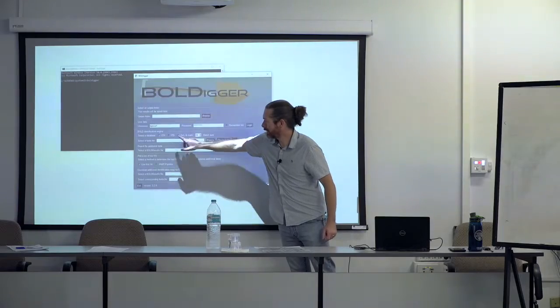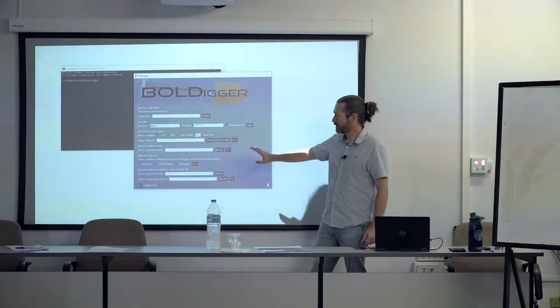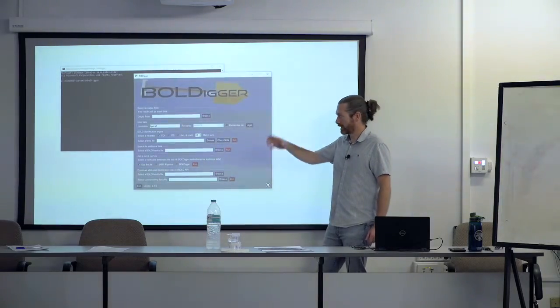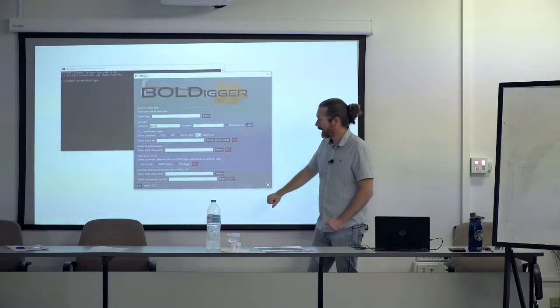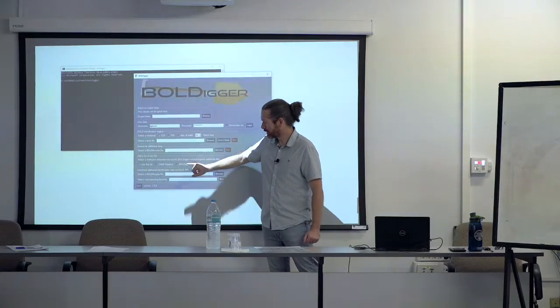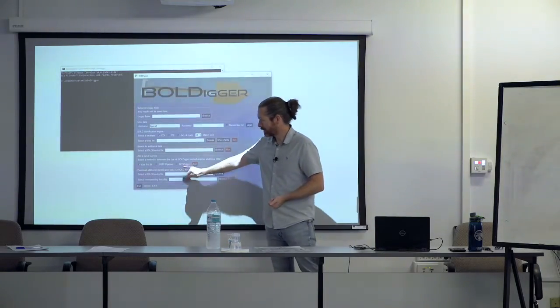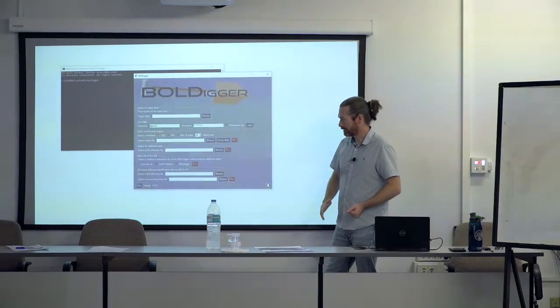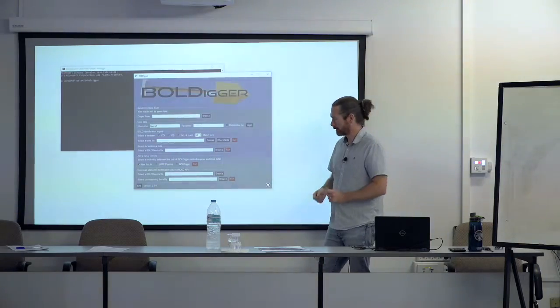It can do other markers. I've never used anything except for CO1. I think there are issues with some of the other markers, at least things like binning and, from the Bold side, the bin algorithms and things like that. So for what we're doing primarily, CO1 barcoding works beautifully. And yeah, you can use the first hit, you can use the JAMP pipeline, or you can use the Bold Digger method for the thresholding matches. The Bold Digger method is essentially the JAMP one at those 98, 95, 90, and something else thresholds. However, it just uses the additional private and public data.